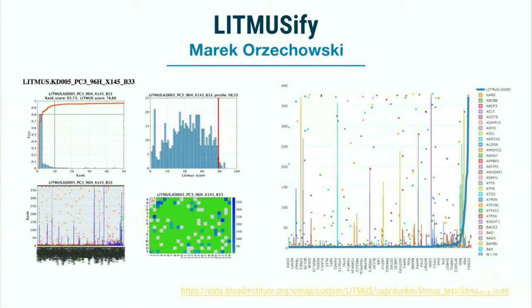So we've got 330 on a plate, and those 330 are within the subset of the 1,000 we measured directly. And what we do is we just ask the question, did the shRNA in this well knock down the gene it targeted more than all the other experiments on the plate? And if it did, then we say, okay, well then the assay is working functionally. We expect to see knockdown of a gene, and we're seeing knockdown of a gene.